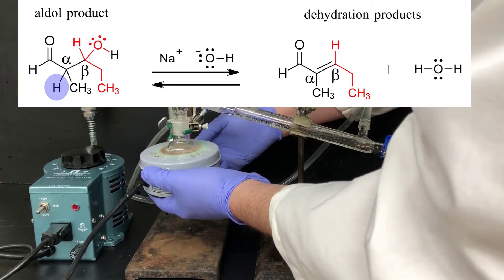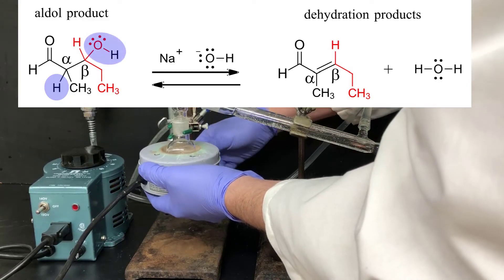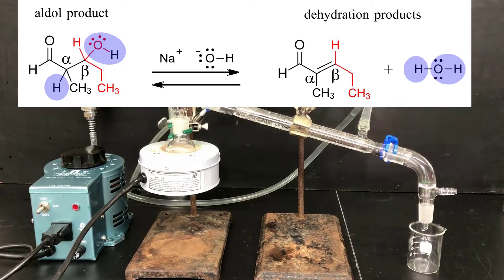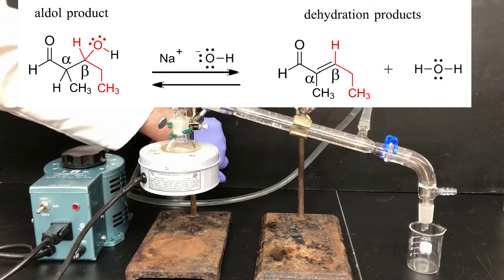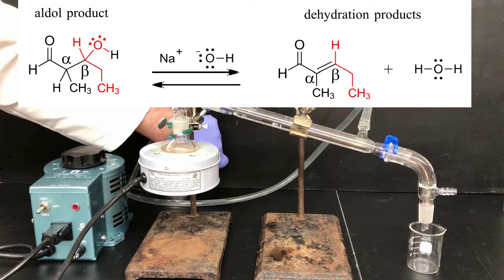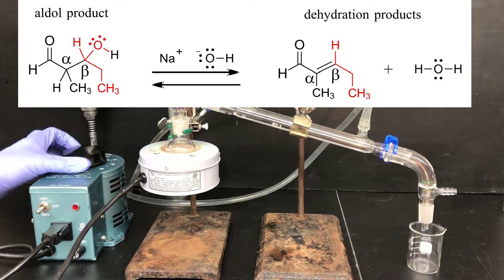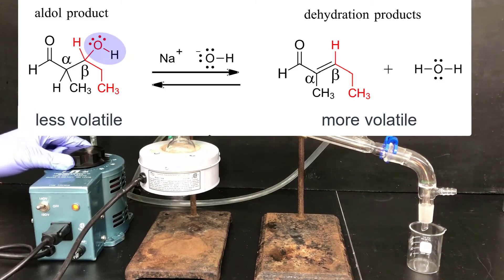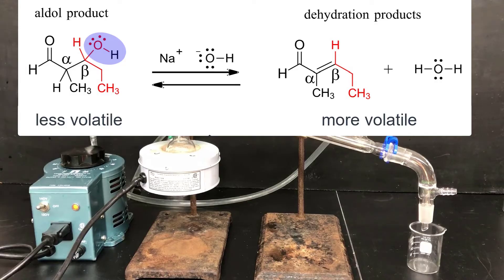The aldol product in today's reaction has an alpha proton and it's subject to a dehydration reaction where sodium hydroxide removes that alpha proton and hydroxide is eliminated. It's an equilibrium process where the equilibrium doesn't strongly favor products, so we need to help the reaction along by distilling the products off as they form. This works because the products are more volatile than the aldol starting materials — the OH in the aldol product makes it much less volatile with stronger intermolecular forces.